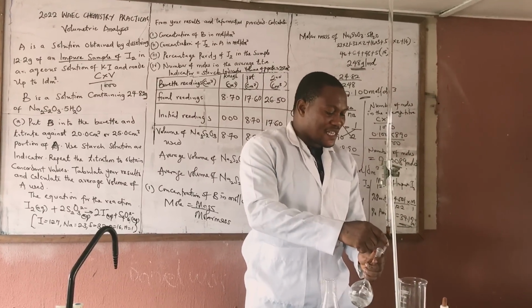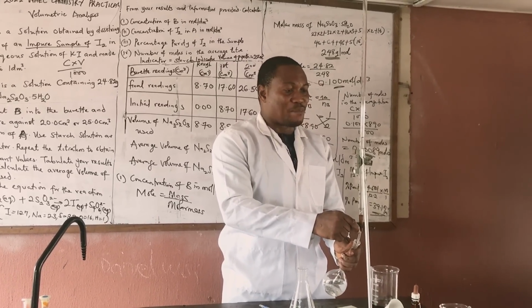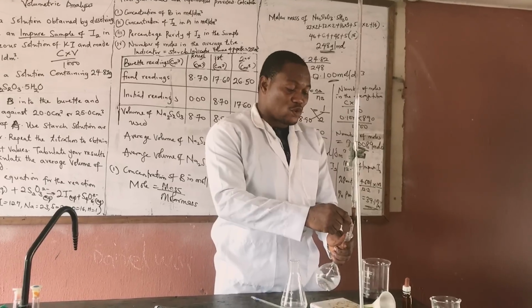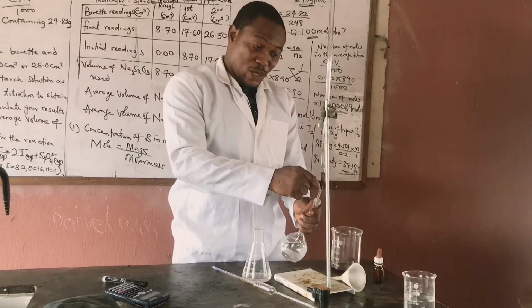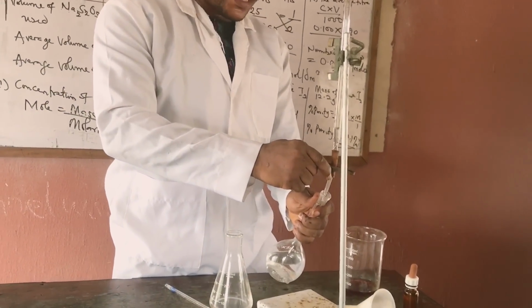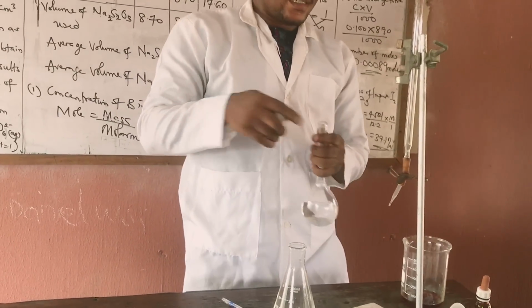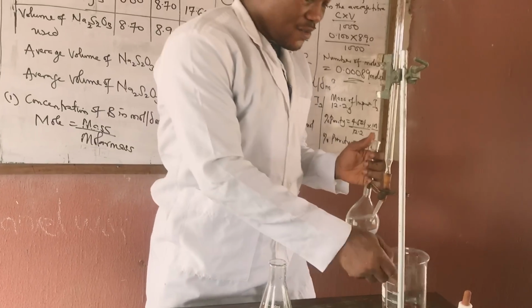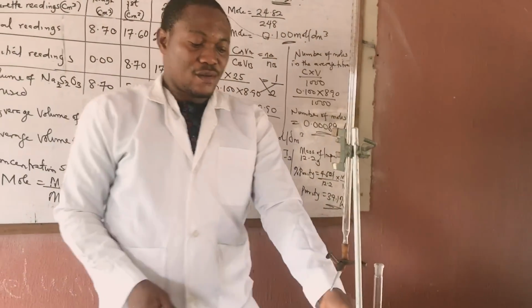Because I've been seeing a whole lot of people with different perspectives. Everybody is entitled to his own perspective. But what I have prepared and what I am seeing without adding anything, let's look at it so that we understand. You know, sodium thiosulfate was in the burette before, and I pipetted this. So let me have this now. I don't have enough of this again.